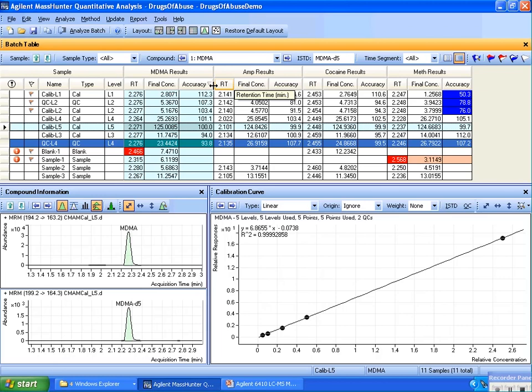That's quite useful. Another feature that I'll show you in terms of column management is that if I wanted the accuracy for some reason to be at a different place in the row, I can pull that and move that and it will show up in a different position in terms of the order here.